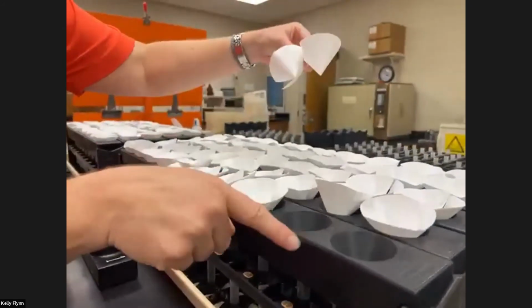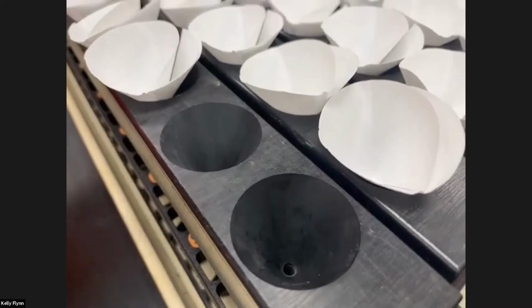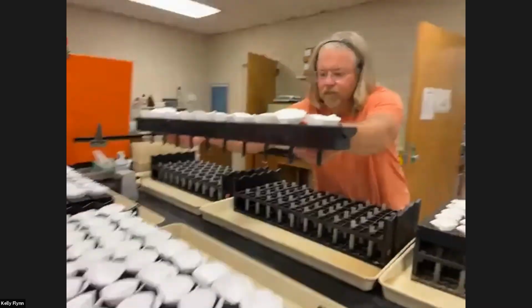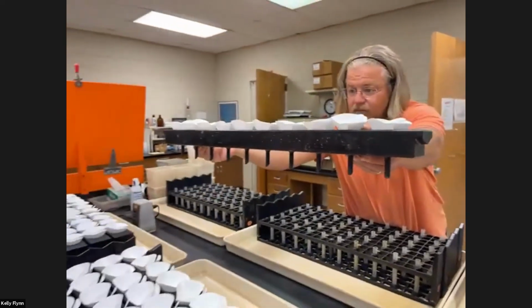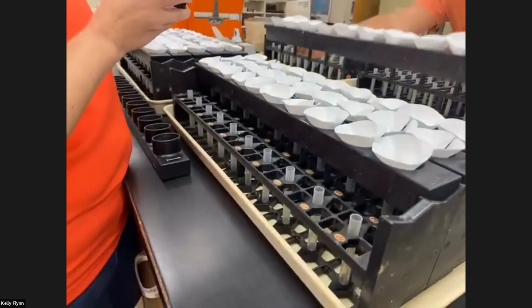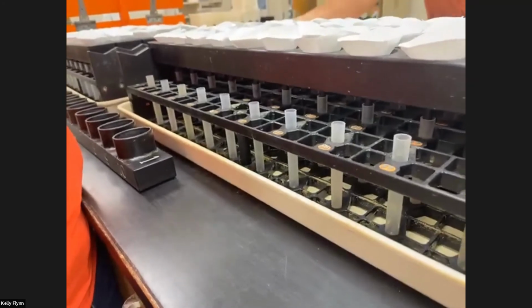I don't know if you can see that. If we lift one of those up, you can see that back there. These are going to drip through the built-in funnel, and then underneath we're going to end up with a test tube containing your solution, which represents your soil.